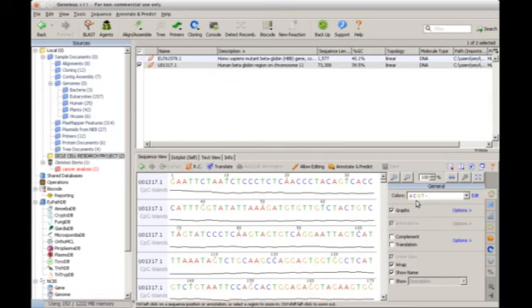If the GC content in the sequence is not high, then the sequence is not stable. Now that means there's a probability that the sequence can easily be affected by foreign invasions.